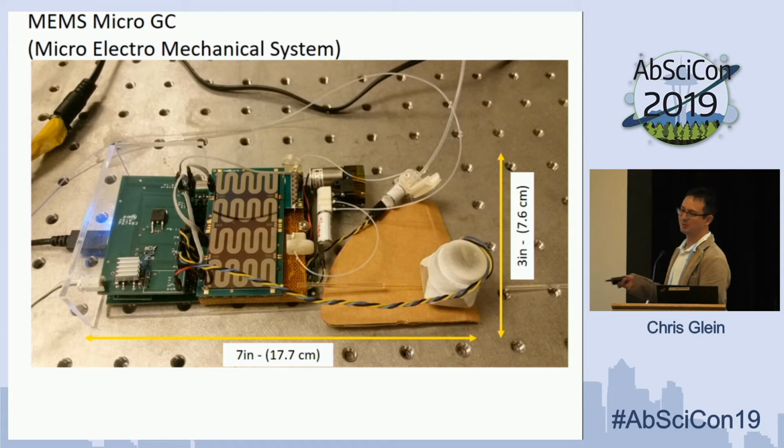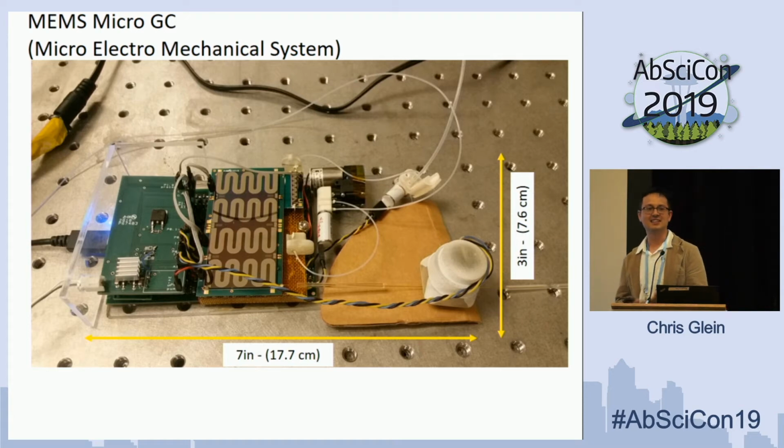I think this is one of the really cool things. I'm willing to risk my neck that this could be the future of GC for spaceflight missions. So you might have dealt with GC in the laboratory, and it's like these horrible metal coils and cages, and it's wrapped around there, and it takes a lot of space, and it's difficult to handle. Well, what we're developing is a micro device GC.